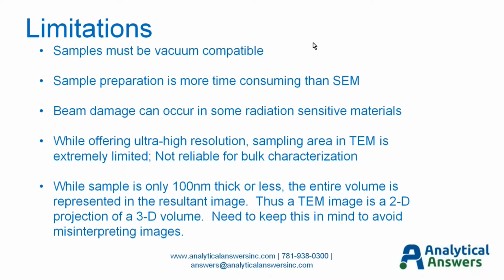As powerful as it is, there are some limitations to TEM. As with SEM, this is a vacuum technique, so samples need to be vacuum compatible. The sample preparation, as you've no doubt figured out already, is more time consuming than for the standard SEM type analysis. We're using high energy beams in relatively small areas, so beam damage can occur in some radiation sensitive materials.